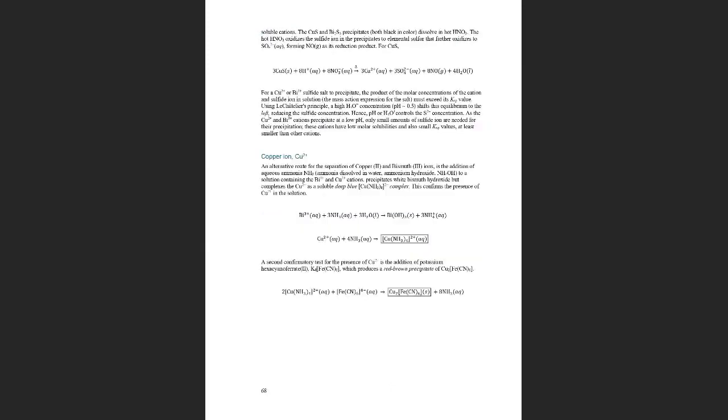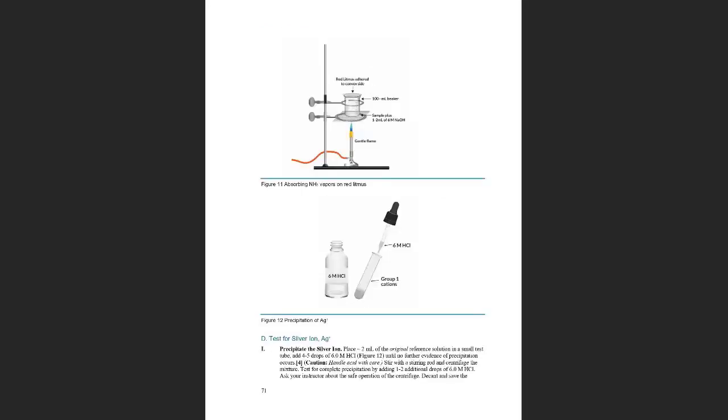Let me see if there is a little drawing of the setup of the experiment. Okay, not here. Okay, right here. If you are in the lab, this is what you are going to do. So basically, you have the sample here of the ammonium salt, and you add the sodium hydroxide.